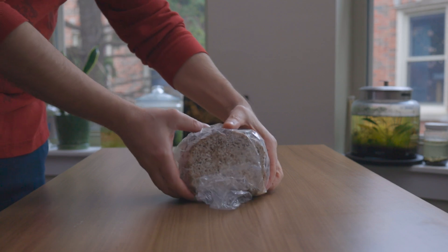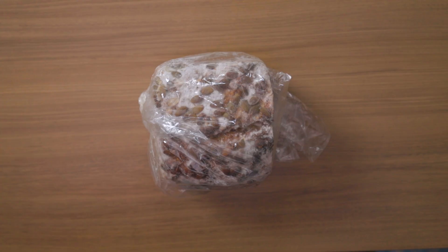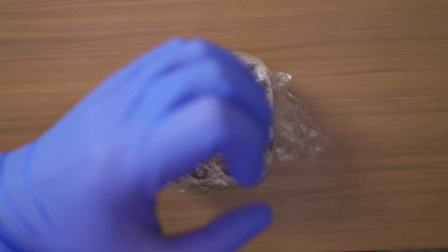Within days, the bread was covered by a white filamentous structure. Touching this bread is not that simple anymore.